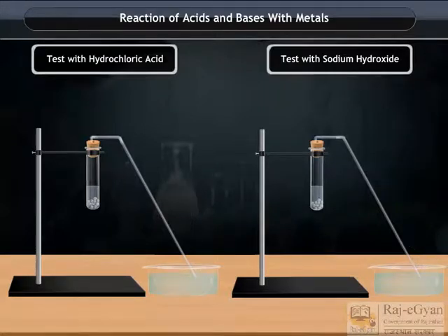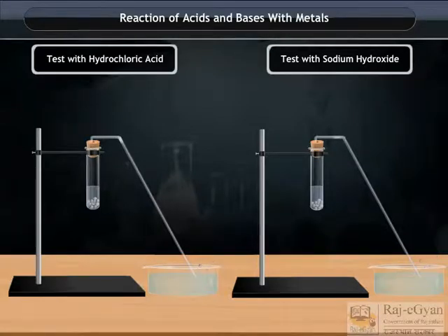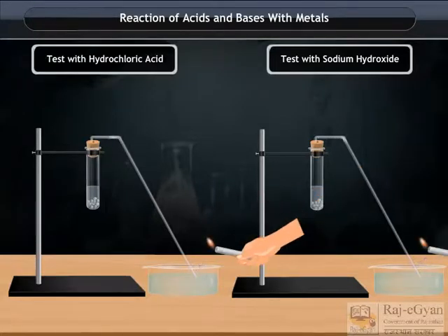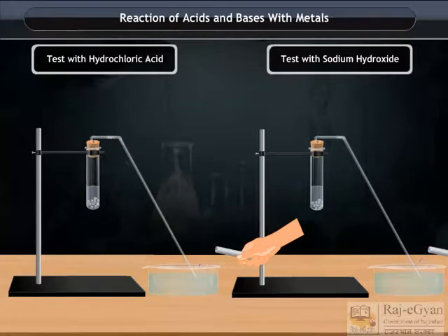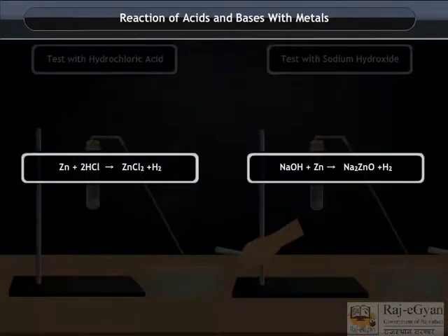Now observe them carefully. You will observe some bubbles — a gas is produced in both the test tubes. The gas evolved passes through the soap solution. Take a burning candle near a gas-filled bubble and observe carefully. You will find that a pop sound is produced.